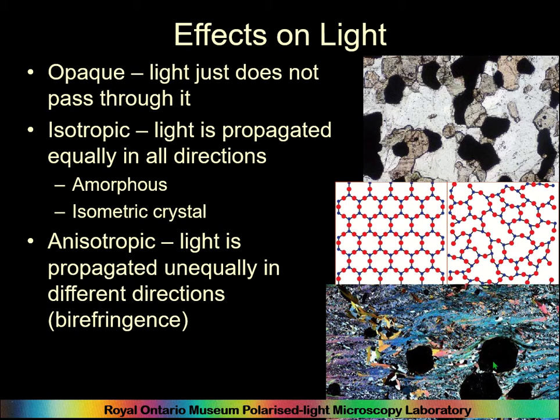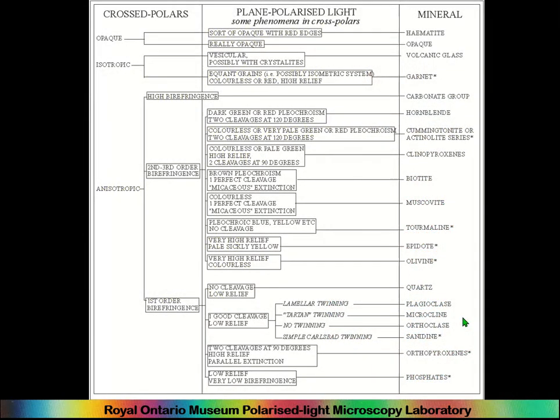Also notice these. So what are they? Do you think they're opaque? I think they're actually garnets by their shape. So in plain polarized light, they would not. Light would pass through them. So what do we have next?